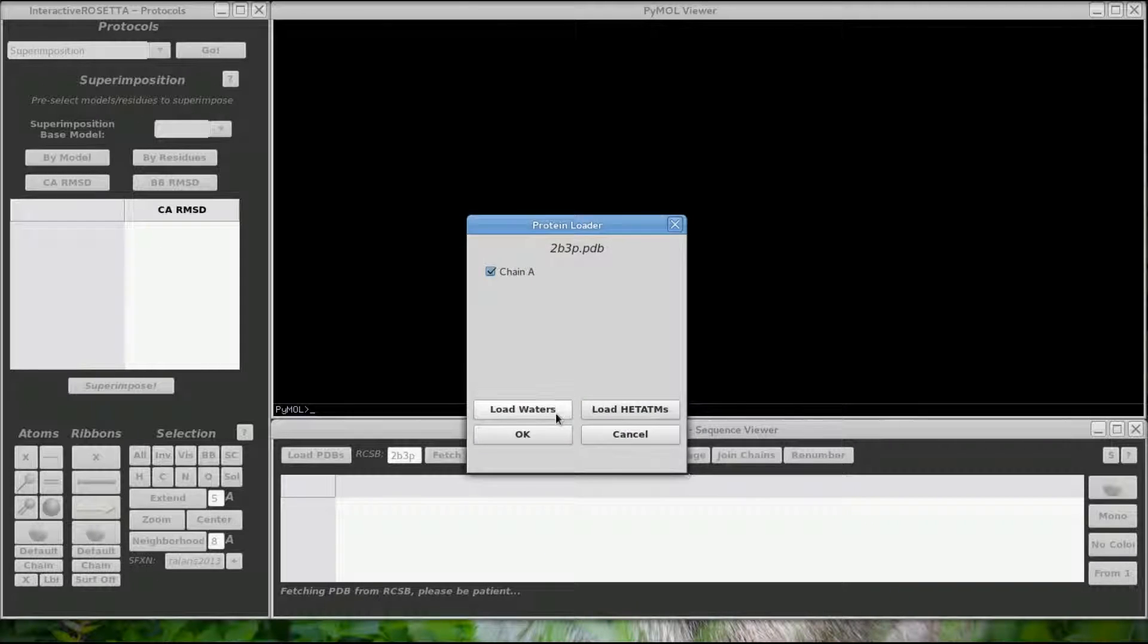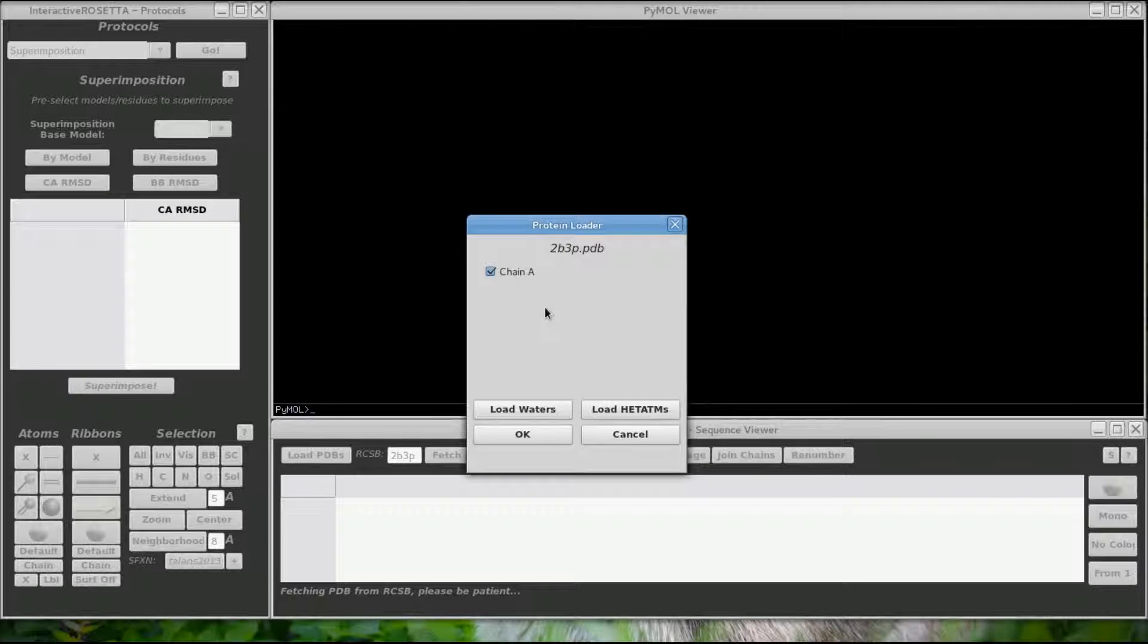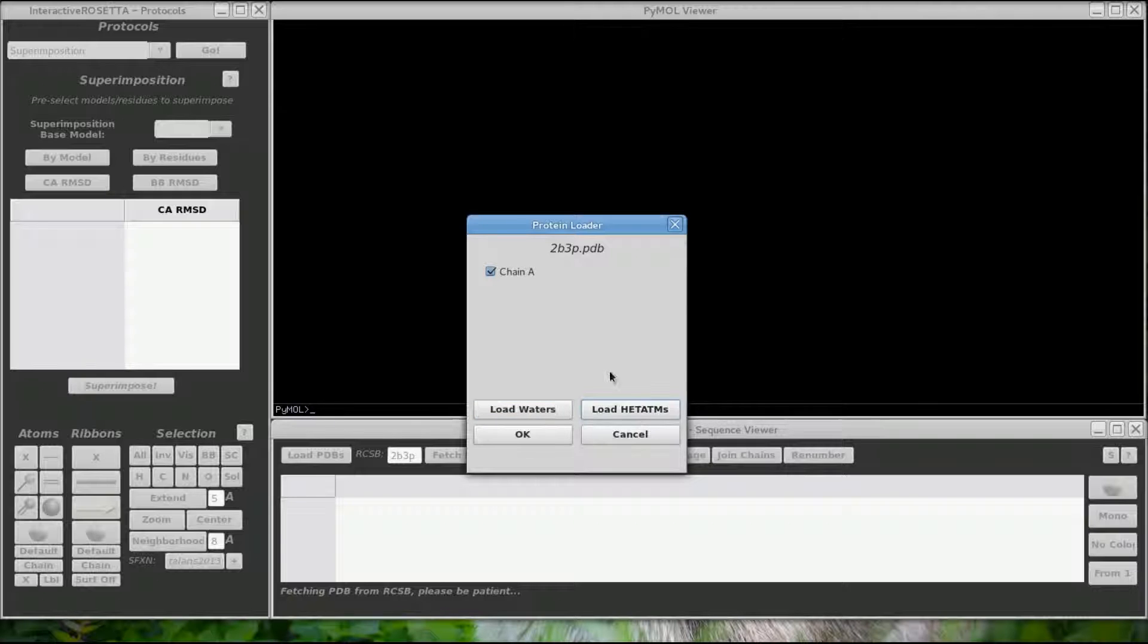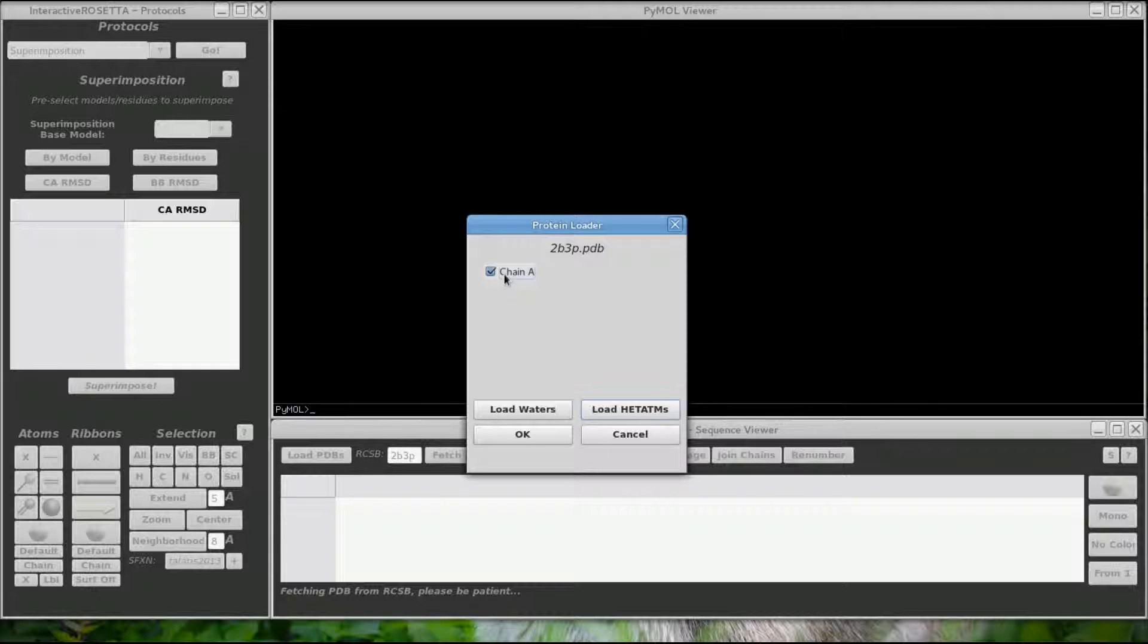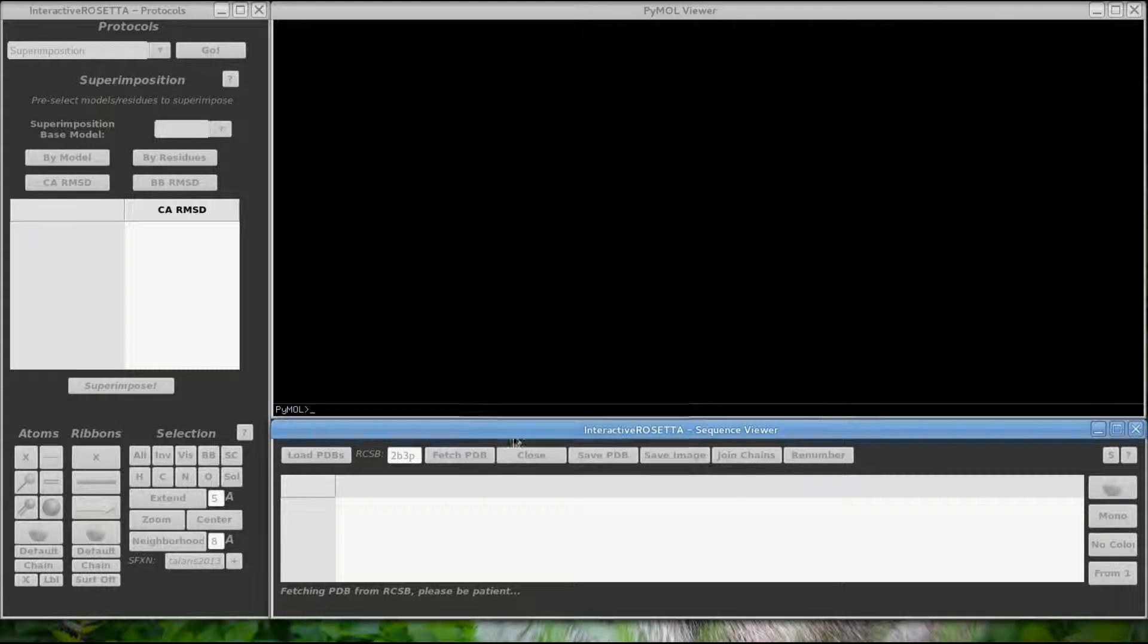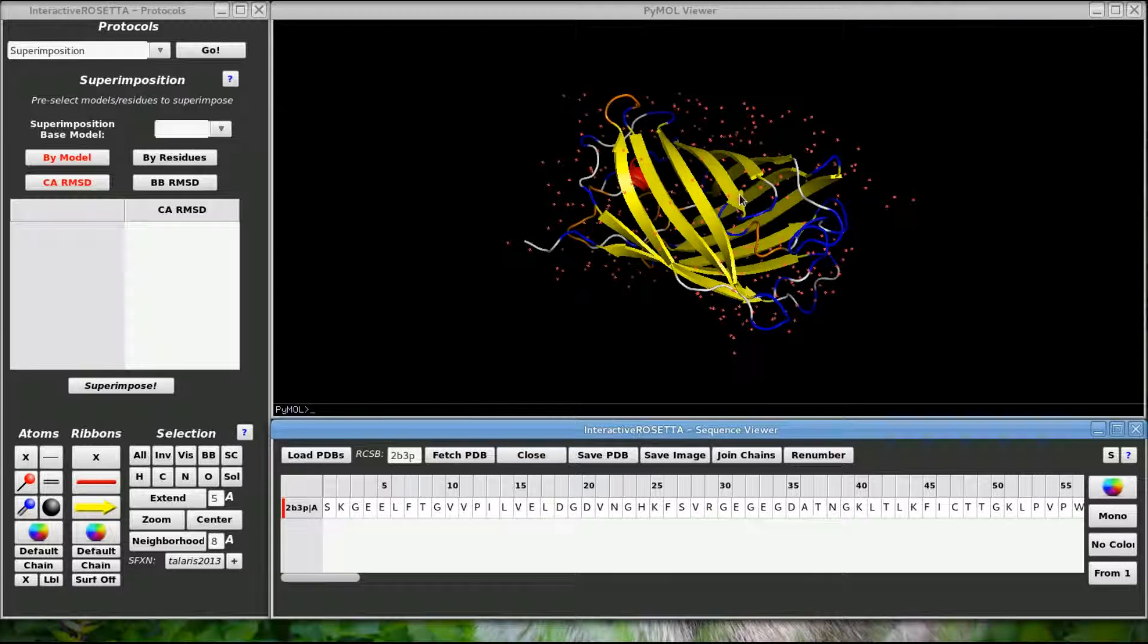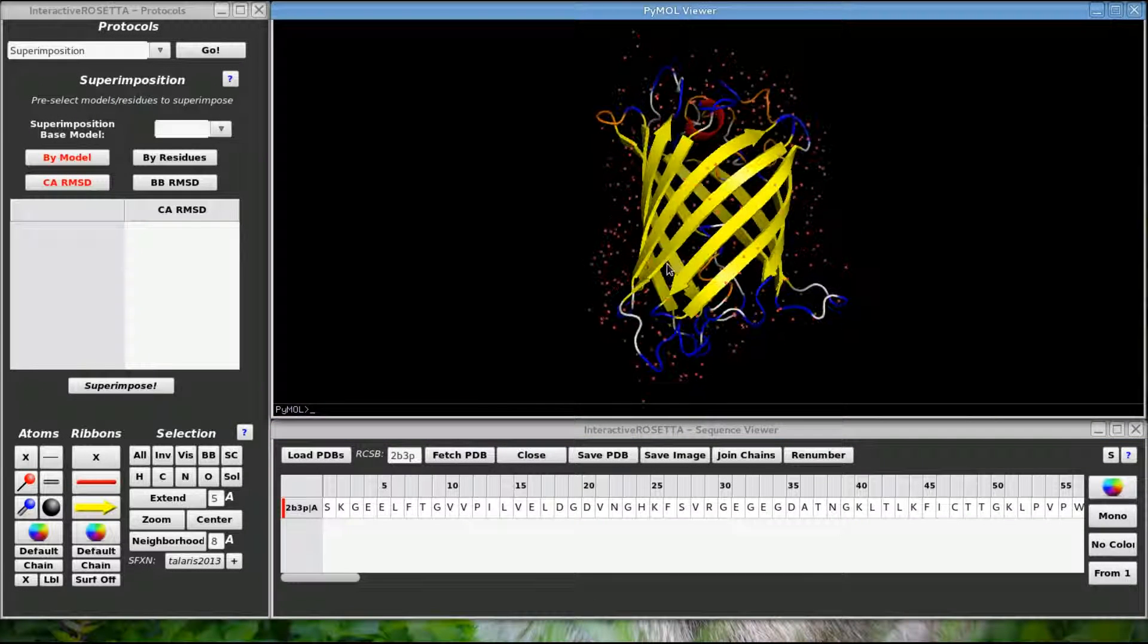This is a new window. Looks like GFP has some waters and hetero atoms in it. I can click these buttons to toggle whether these atoms will be loaded into Pymol or not. Also, if I had multiple chains in the structure I could opt to only load certain chains. And there is our GFP molecule.